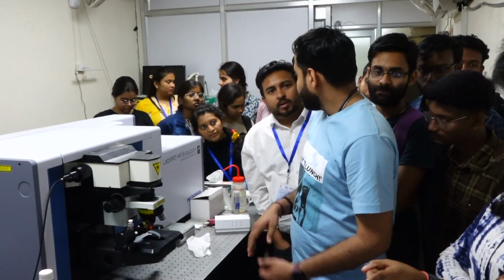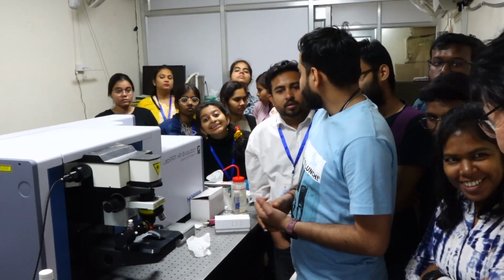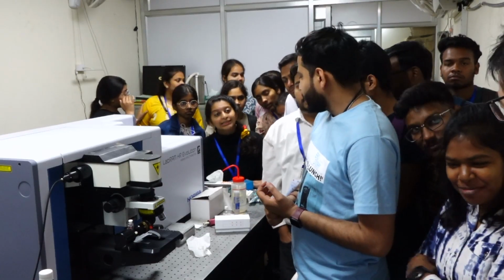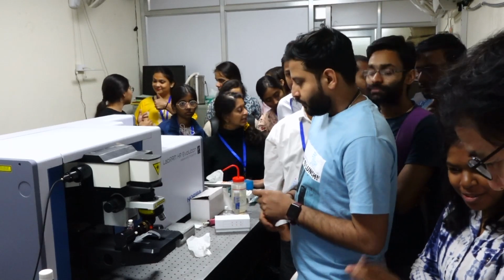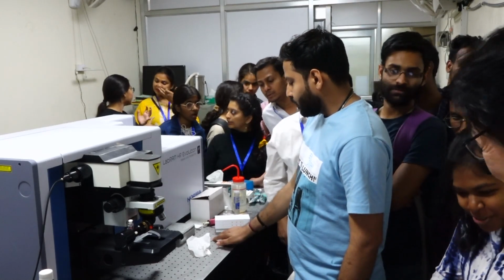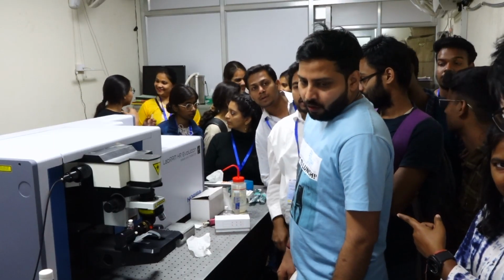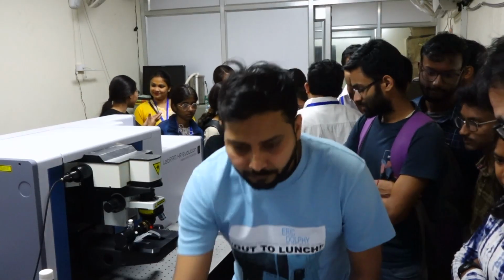Why is it coming at this position all the time? I am thinking it may be some defect. The position may vary, but all the time it is coming at the same position, in the previous measurement also. Yes, there is some problem in the detector. So it happens.